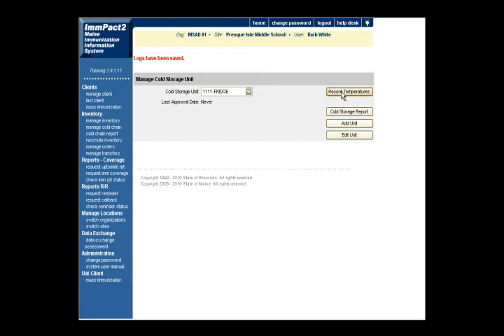If somebody comes along behind me and sees that the temperature is too low, I don't want them to adjust the thermostat if I have already adjusted the thermostat. It's a good way for people to know that temperatures have already been checked, if something has been done to correct a cold chain incident, so that you don't have multiple people doing actions to counteract what has happened in an incident.